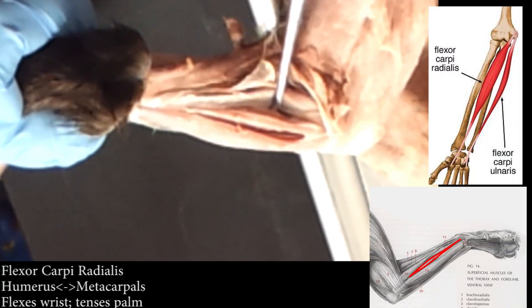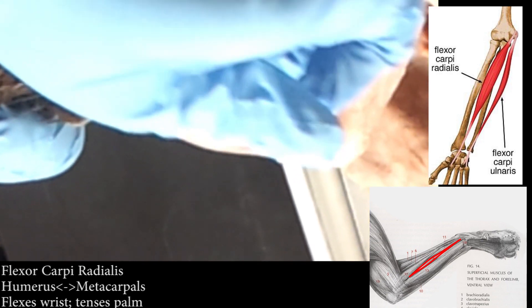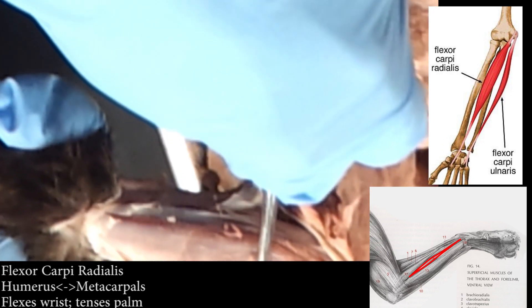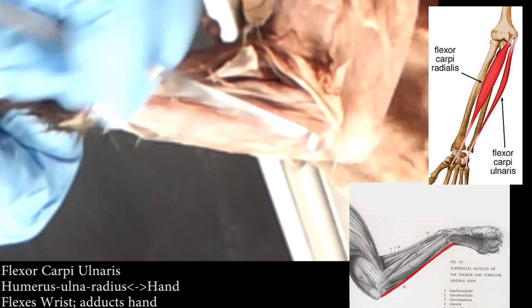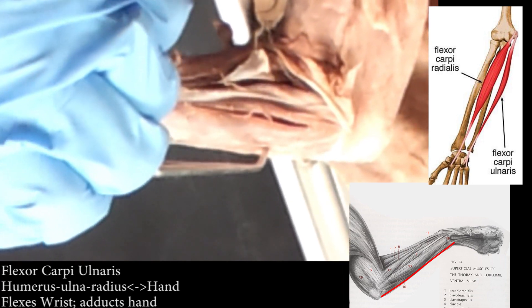So here's my thumb. That means this muscle on this side — right here — is flexor carpi radialis. So find your center one, palmaris longus, then you find the thumb, and this is going to be flexor carpi radialis. Which means that this guy on the other side is flexor carpi ulnaris. That's why we find palmaris first — it's flanked by the flexors: palmaris longus, flexor carpi radialis, flexor carpi ulnaris, side by side.